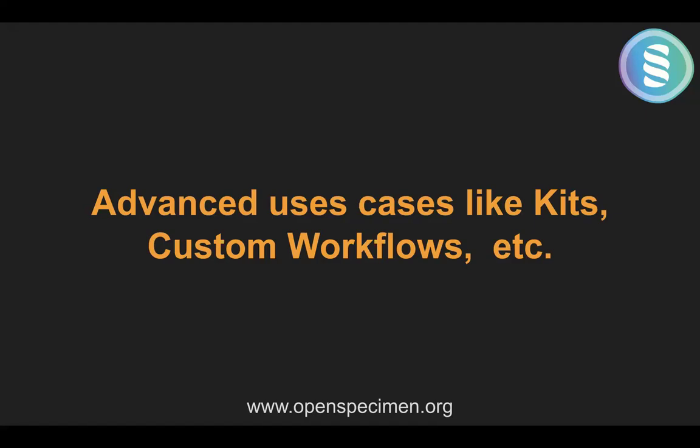For example, one of the trials has a serum processing workflow, but some other trial would have a completely different way of processing serums. Sorry. So we developed a lot of custom workflows, and now they also develop them themselves because we have trained them how to do the workflows.